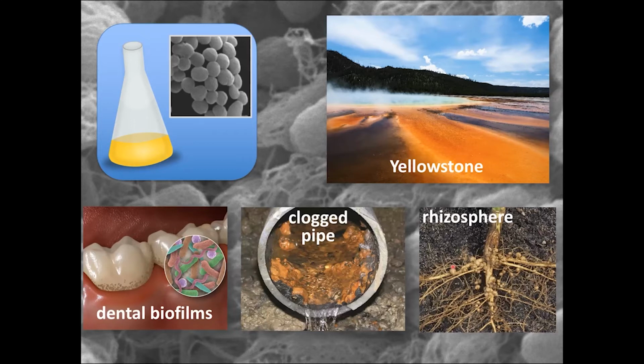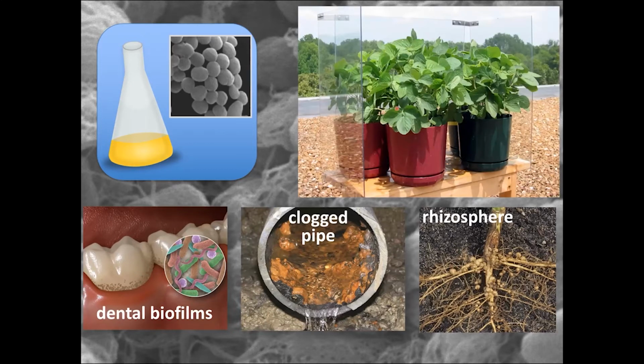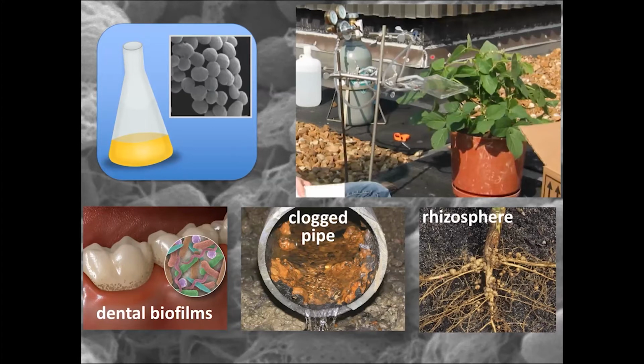I learned a lot about rhizobia when I was a graduate student, actually doing whole leaf NMR, growing soybean plants. These are soybeans, and to inhibit the production of these rhizobia, we fertilized the plants with N15 ammonium nitrate and then did solid-state NMR on those. We also flowed over the leaf a C13 CO2 gas mixture to get carbon-13 into the leaf. So where there's a will, there's a way with solid-state NMR and complex biosystems.